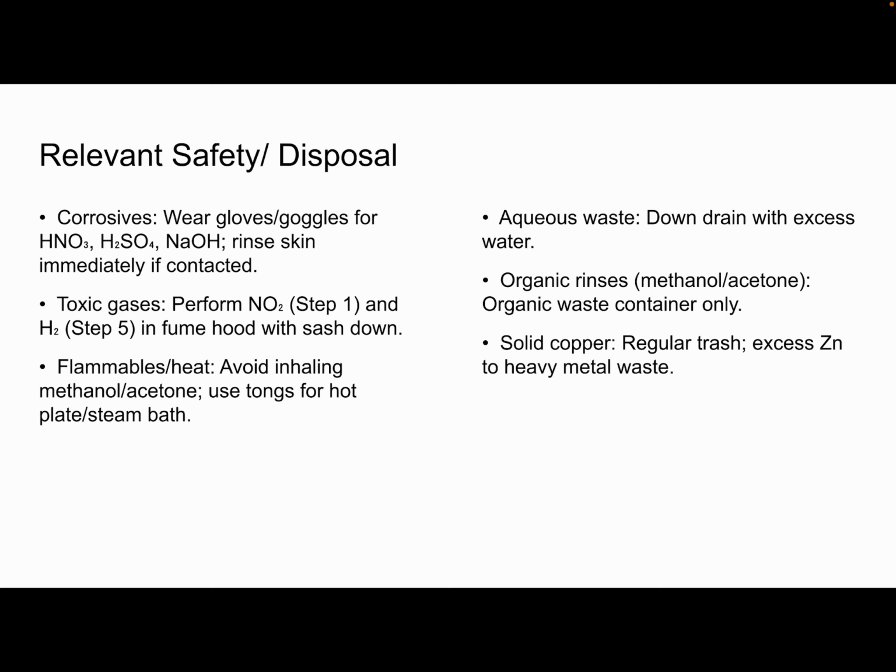Like when we added the copper to the, I believe it was HNO3, we had to do that under the fume hood because of the gases. Or when we added the zinc to it, there were certain gases that just weren't safe to inhale, so we used the fume hood. There were flammables, which are also used under the fume hood. Aqueous waste was washed down the drain, organic rinses were collected, and the copper was just thrown in the trash.